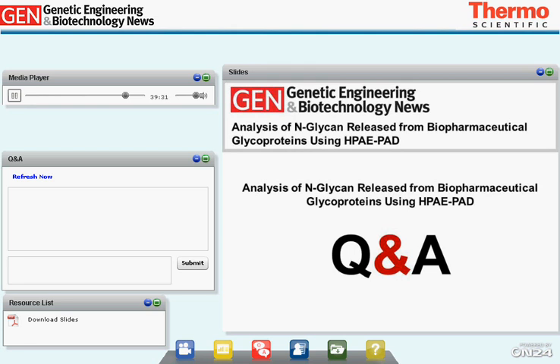Okay. And Sebastian, what is the limit of quantification for N-glycan mapping via HPAE-PAD? Here again, on one hand, it's a matter of the HPAE-PAD system. If it's in good condition with a new 3 mm gold electrode and a CarboPac PA200 column, you get a good signal-to-noise ratio. On the other hand, it depends on the N-glycan structure, as large structures, highly antennary, highly sialylated, give a high response, whereas a small truncated structure gives a low response.